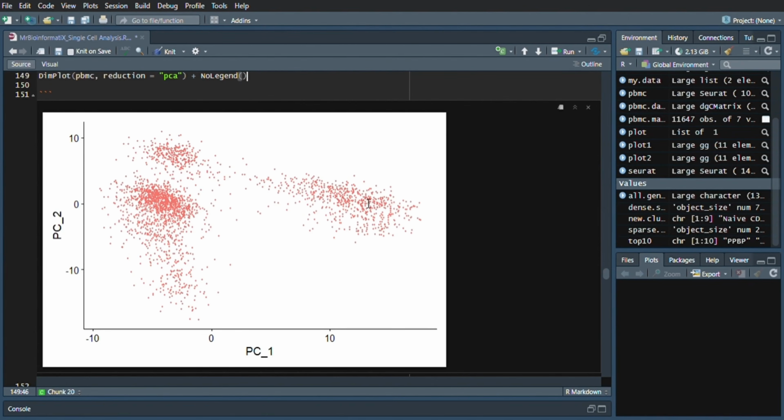As you can see, we have two big groups, here and here. Group 1 is located at -5 on PC1 and about 0 on PC2. This cluster represents the cells that have lower values on PC1. These cells share common gene expression features that lead them to be grouped together on this side of the plot.